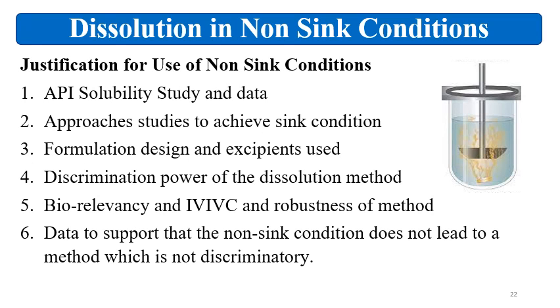Then whenever we are using non-sink condition, then what type of justification is required? So the justification should give the details about the API solubility study and the data. Then whatever the efforts taken by the applicant or approaches for the studies to achieve the sink conditions, these are to be given.